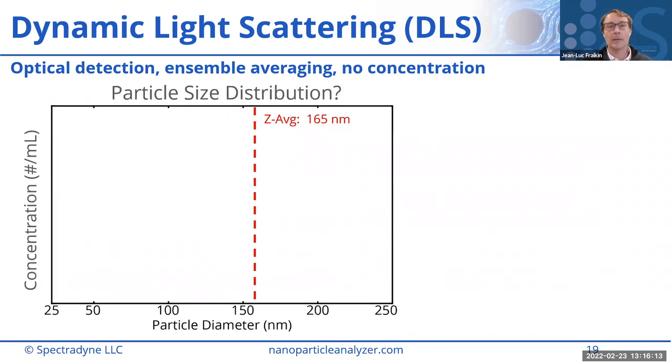Why is that? Well, a sample that we would love to see generate a scattering distribution like this would have a normal distribution centered at that diameter, nicely well-defined with a narrow distribution, right? This would be the dream. You've got a nice, well-formed product, right?